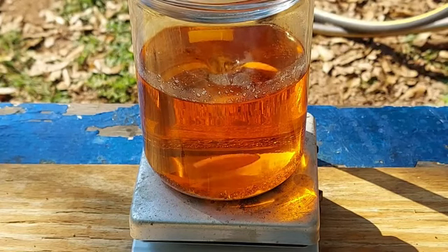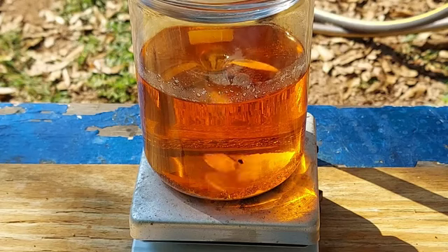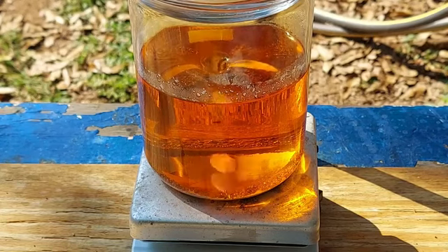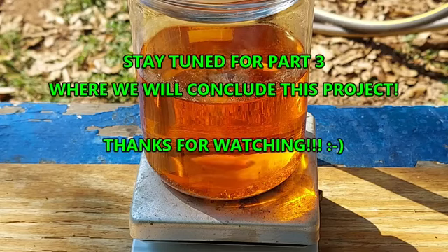I wonder if bromine reacts with chloride to form a mixed trihalide ion. Is such a thing possible? Is it stable enough to exist even as a fleeting intermediate? Because I would think that would be a very powerful oxidizer indeed, given that it's asymmetric. Anyhow, I will come back when there's some other change to show you guys.